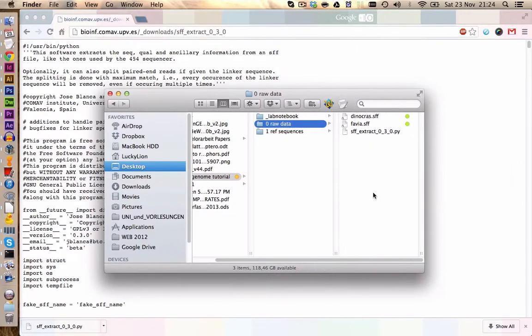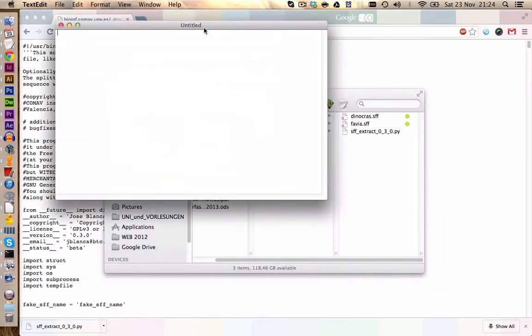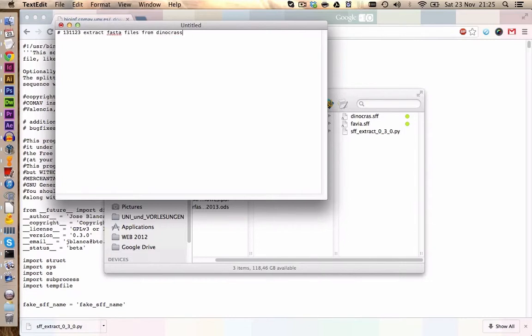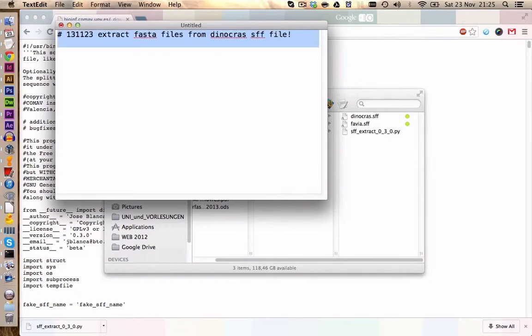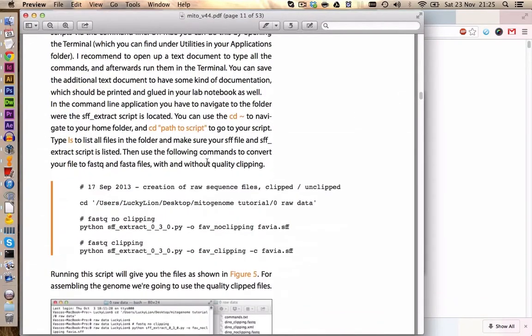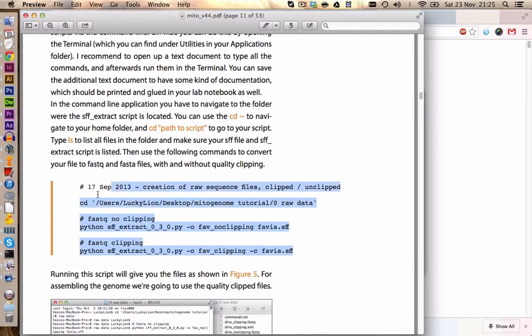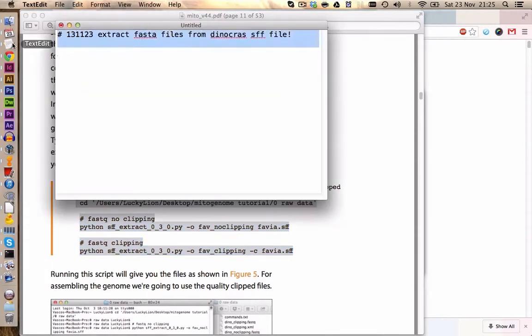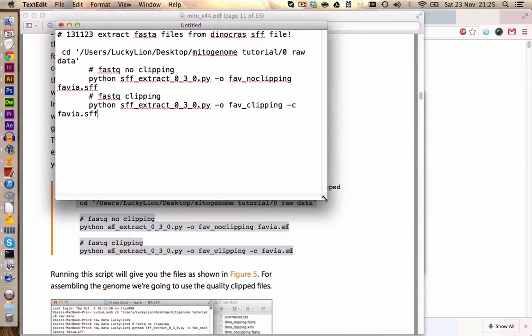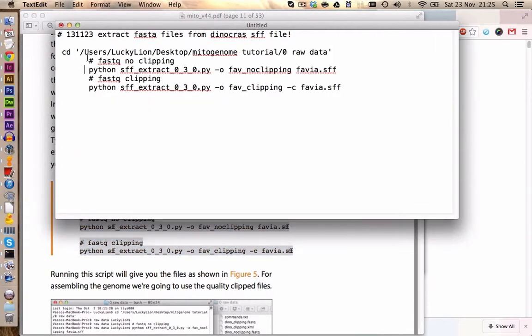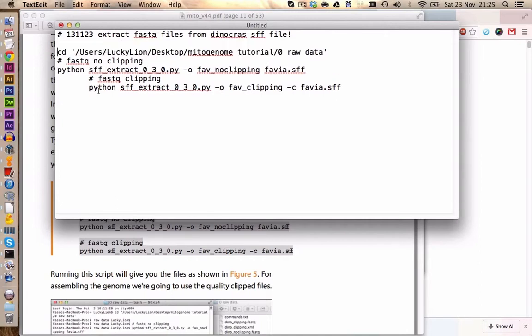When I run some scripts and manipulate some data with the terminal for example, I always open a little notepad document and in here I write some information, for example always the date and then roughly what I have done with those few commands. Let's also make this a little bit bigger. Now we can go to our manual and in here we are just going to copy the sample we have in here. Let's go back to our text document and we paste it in here.